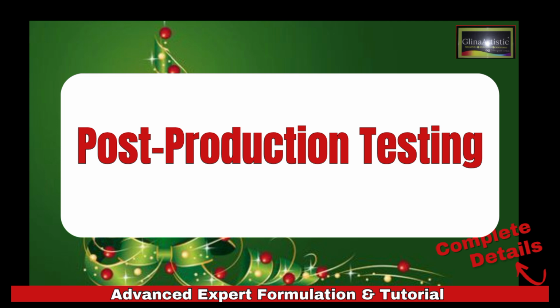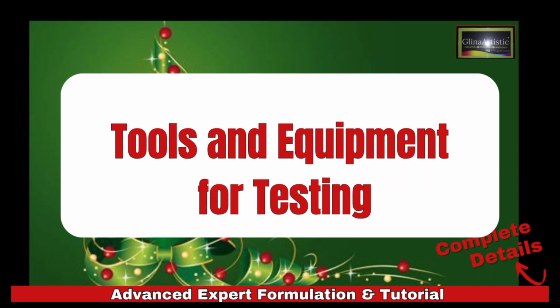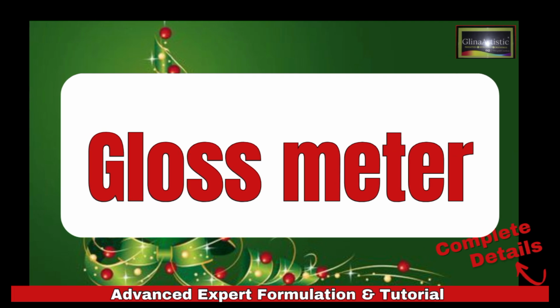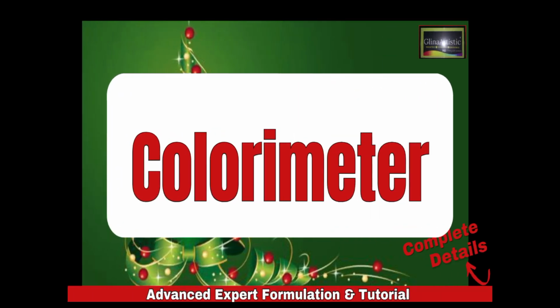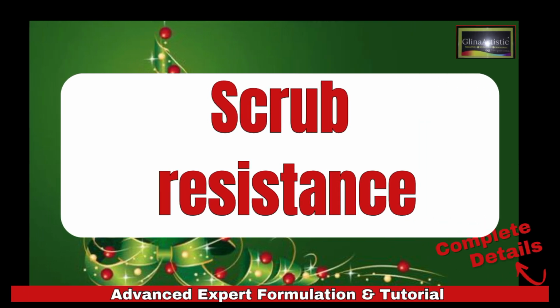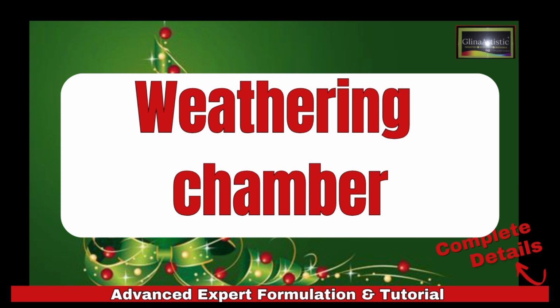So now we'll move over to the tools and equipment for testing. Yes, invest in professional tools to simplify and standardize your quality control process. You can get most of these tools in your country. First is your viscometer, for flow measurement, and then you have your gloss meter for evaluating reflective properties. You have your color meter for precise color matching, and you have your scrub resistance tester for durability check, and your weathering chamber for simulating harsh weather conditions.